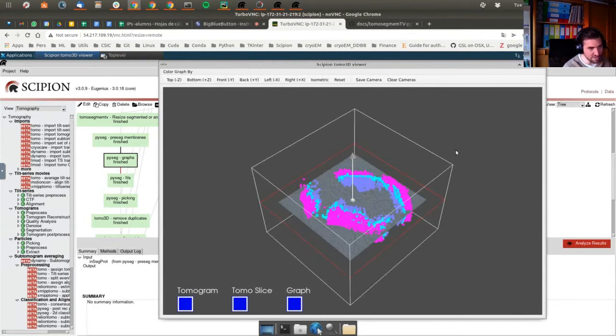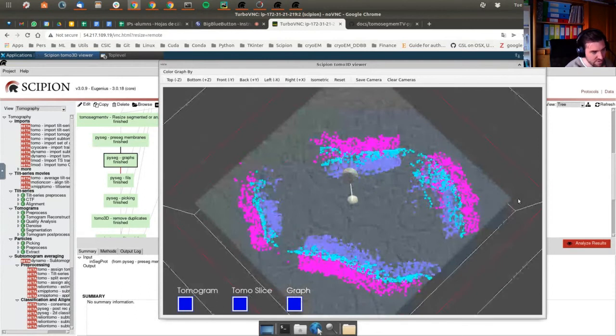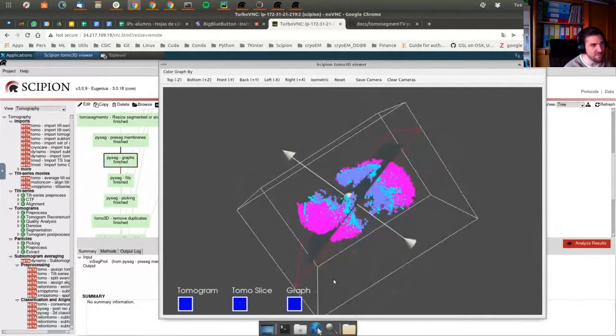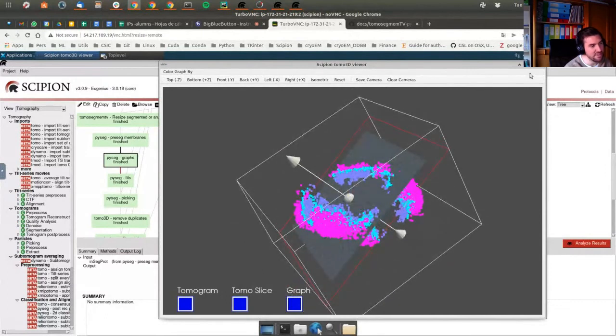So as you can see, just very, very fast. You can use the slicing, you can check the orientation of the slices and do whatever you want with it, just to play different representations, the slicing. With the filaments, you can have the cutting point, and you can paint using different criteria.